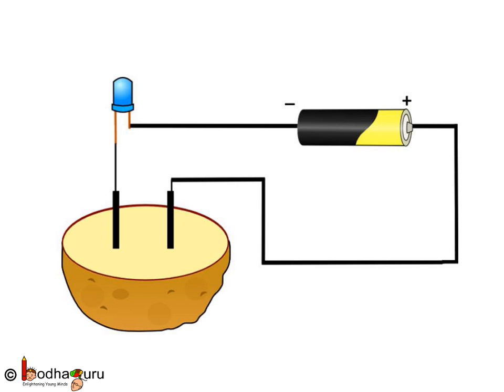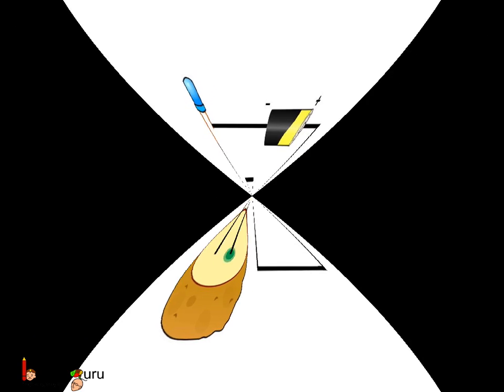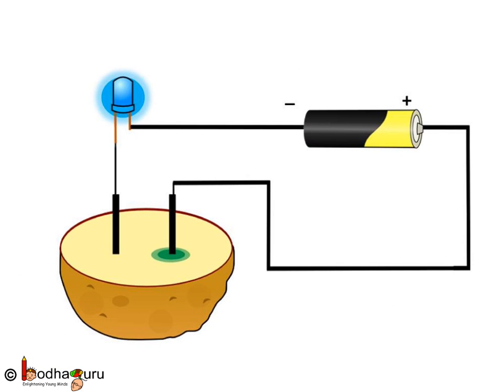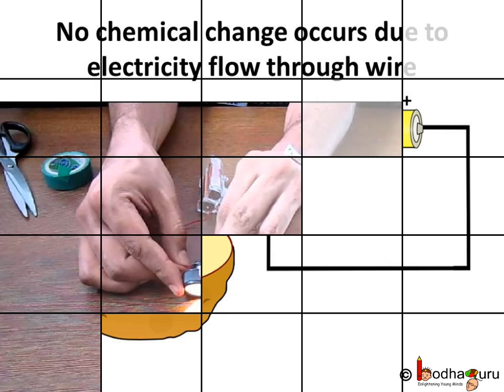What do you see? You will see the LED will glow. Keep it like this for some time. After some time, a greenish blue spot appears in the spot where the positive end of the cell is connected. This chemical change was caused by electricity.